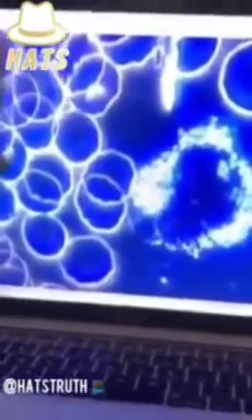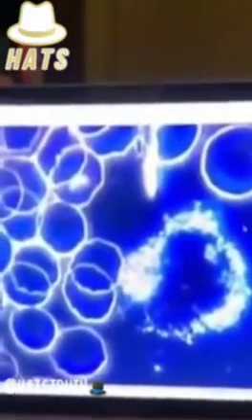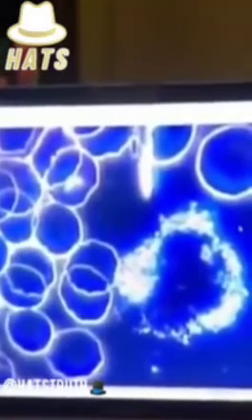Yes, definitely nothing organic. Nothing organic. I took it because you can actually see the cell surfaces here are really not healthy. So the cell membranes are not healthy. That's usually happening if there is some intoxication or something happening.